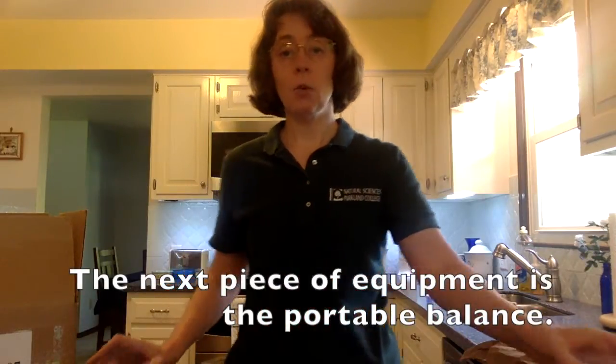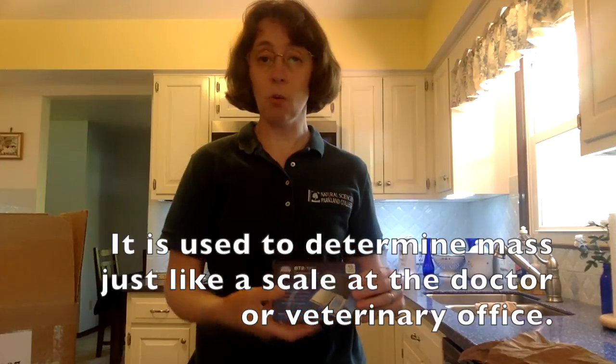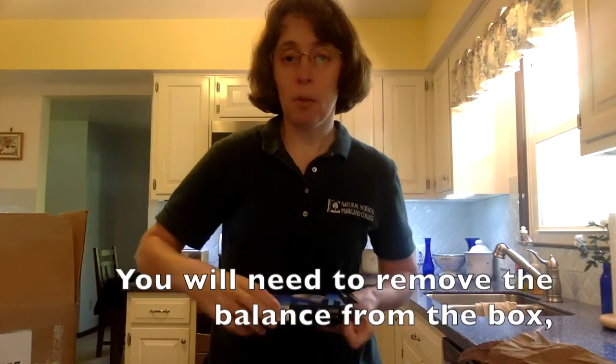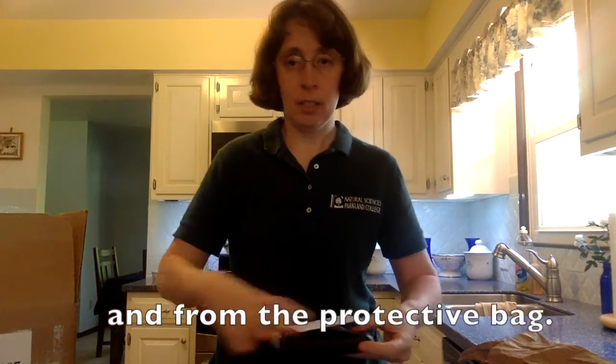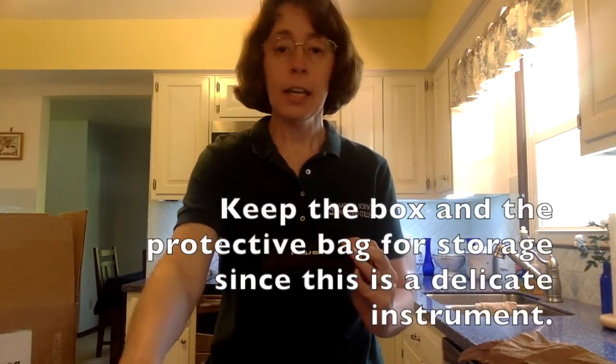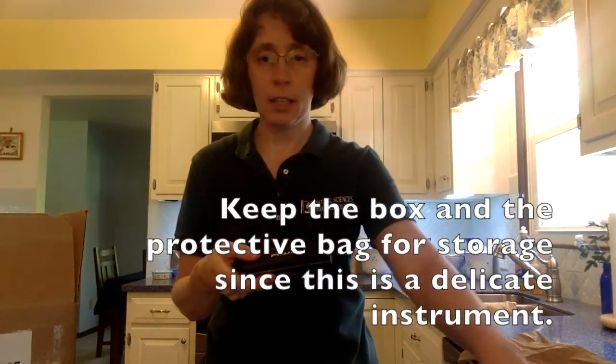The next piece of equipment is the portable balance. We sometimes call this a scale. It is used to determine mass, just like a scale at the doctor or veterinary office. You will need to remove the balance from the box and from the protective bag. Keep the box and the protective bag for storage, since this is a delicate instrument.